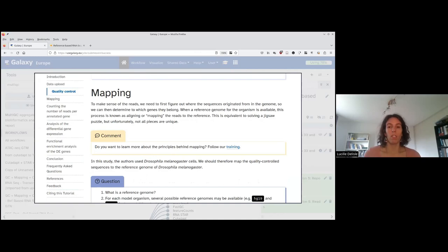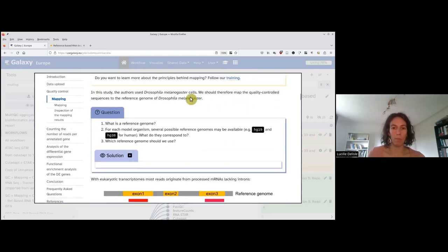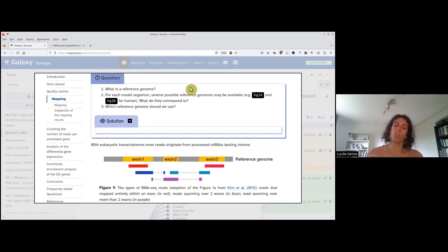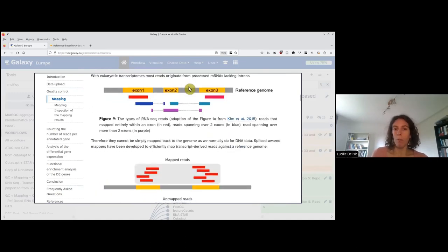Now that we have cleaned our reads, we are going to do the mapping — assigning reads to a place on the genome. For more information, you can follow the training on mapping. Here we are doing reference-based RNA-seq, meaning we work with an organism for which we have a reference genome available — the sequence for each chromosome — as well as annotations indicating the coordinates of the genes. Since we are using Drosophila, we are going to map onto the Drosophila genome.